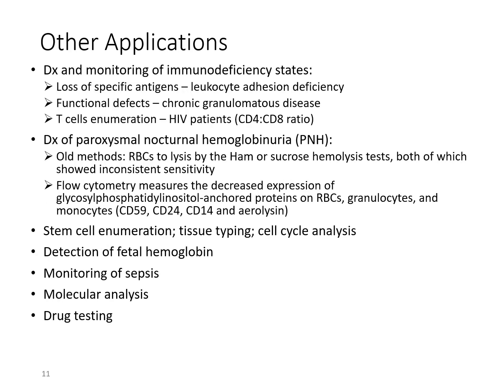Now typically when you think about flow cytometry and using the various CD markers, we think about diagnostics for various neoplasms. However, flow cytometry has advanced to the point that we're able to use it for other things than just diagnosing neoplasms.